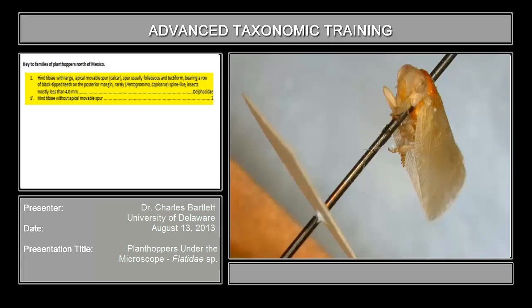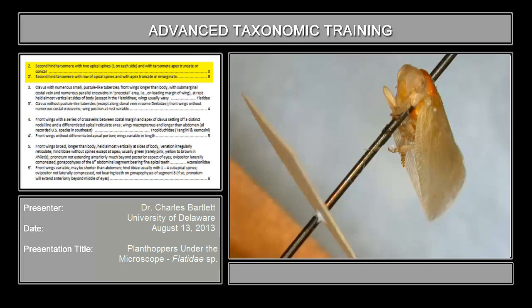Given that the movable tibial spur is not there, we go on to couplet two. The second couplet reads that the second hind tarsomere bears two apical spines and the apex is truncate or conical, as opposed to the second hind tarsomere with a row of apical spines and the apex truncate or emarginate. We're more or less in the right view — that's the first tarsomere and that's the second tarsomere. If you look at that tarsomere, you'll discover it has a pair of spines as opposed to a row of spines.